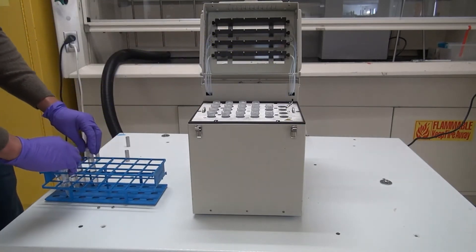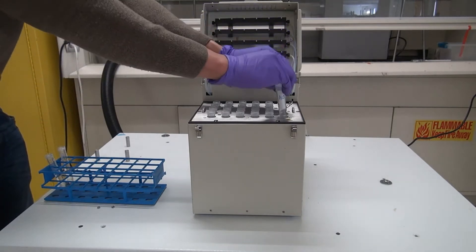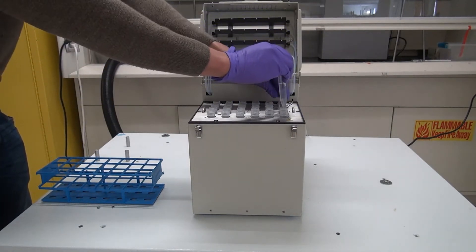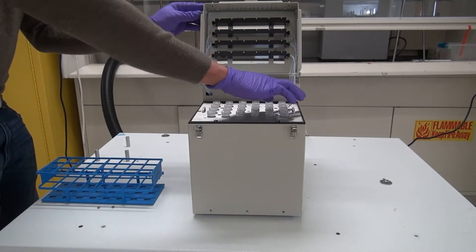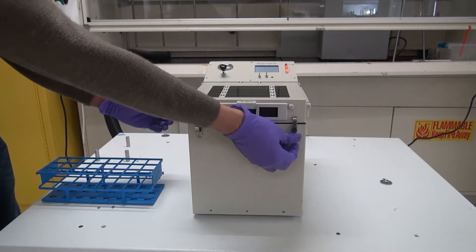As you can see it's a very small format, it's a 13 by 13 inch format so it can fit basically anywhere in the laboratory. So you can see it loads up very quickly. We're going to latch that down.